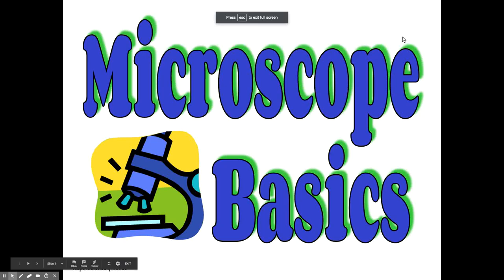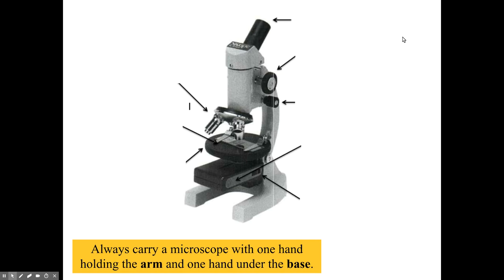So this is our microscope introduction lab. First thing is that you always want to carry the microscope with one hand holding that curved arm and one hand under the base of the microscope. So two hands when you carry it back and forth from the counter to the table and so on.